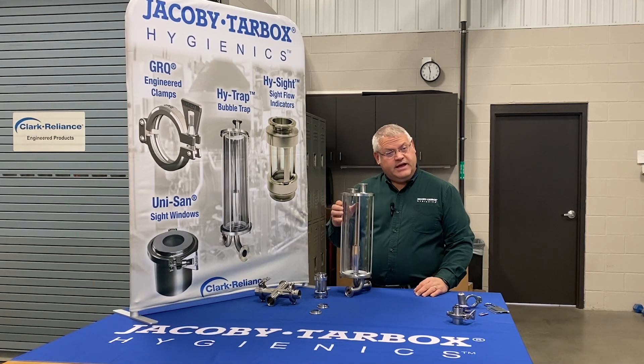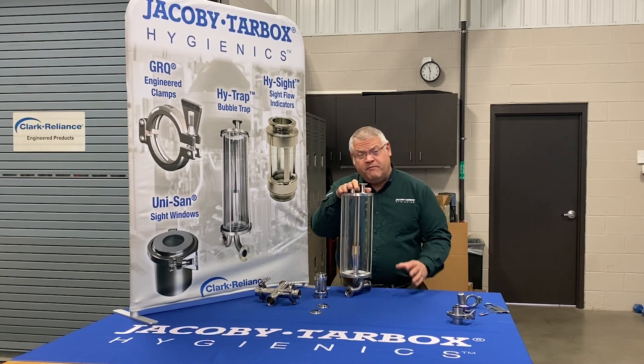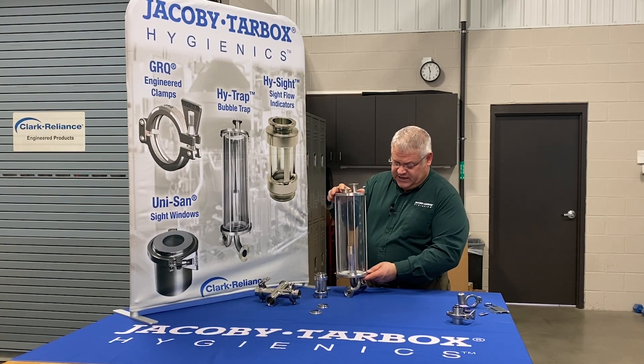The Jacoby Tarbox Bubble Trap, the Hi-Trap, is offered with a variety of end connections and styles. Some features are common amongst all of the designs, however.